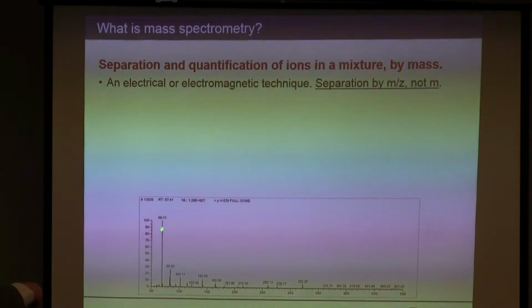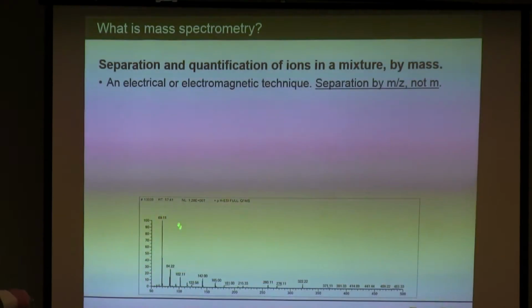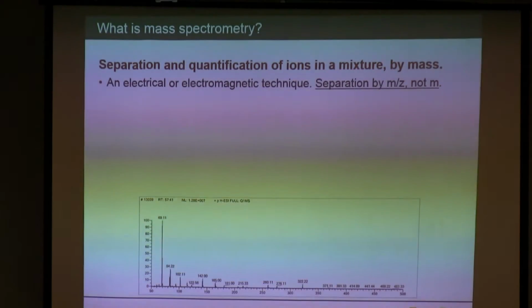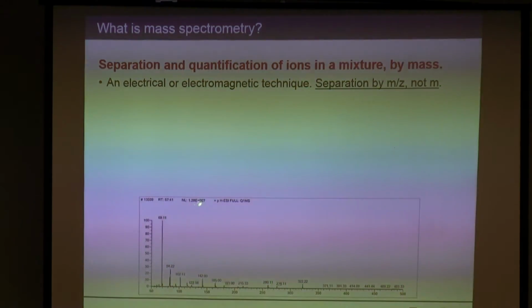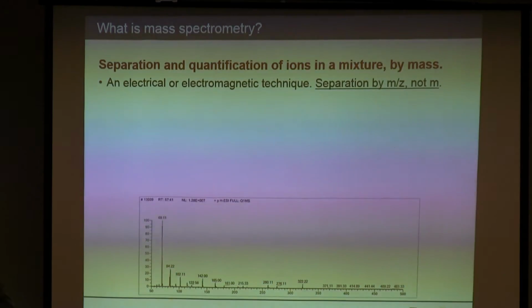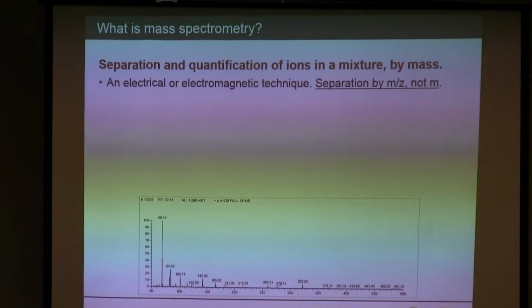Spectrum, and then we have the quantitative peaks of how much we got when we were scanning that particular mass. So there's something with a mass of 69, which I think here in this mixture is imidazole. I don't know what any of these others are. We have 1.28 times 10 to the 7 ions per second, or a little bit less. It tells us what molecules are in a mixture.